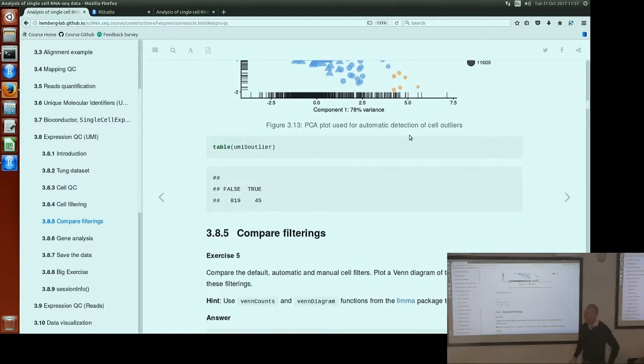So if we run automatic outlier finding in Scater, Scater found 45 cells that it wants to remove, which is much lower than what we found manually. What about PCA? If it tells you the features pointing to one of the dimensions or components, then you can roll it back to know whether it is basically filtering based on ERCC genes or on different features. Is it possible to interpret it reversely?